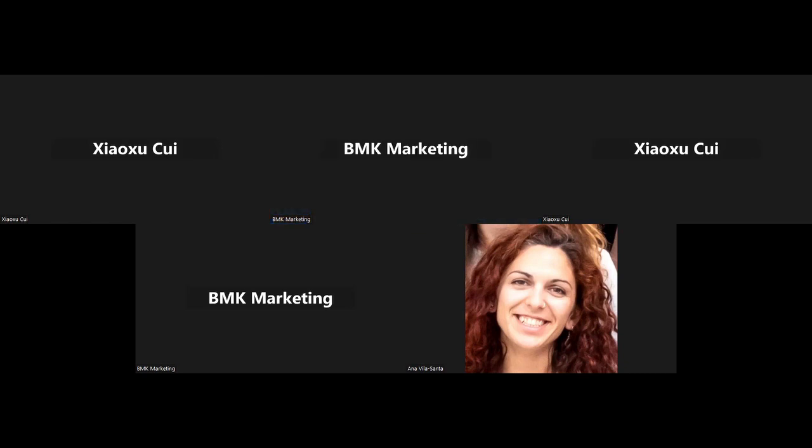Thank you very much. The next question is for Anna. What is the difference in cost between amplicon sequencing with Illumina and PacBio? Of course, the difference may vary between projects, but I can give a rough estimate that it can be around €3 more per sample doing PacBio full length instead of short reads. So I think it's really worth it, given the advantages that you get out of it.